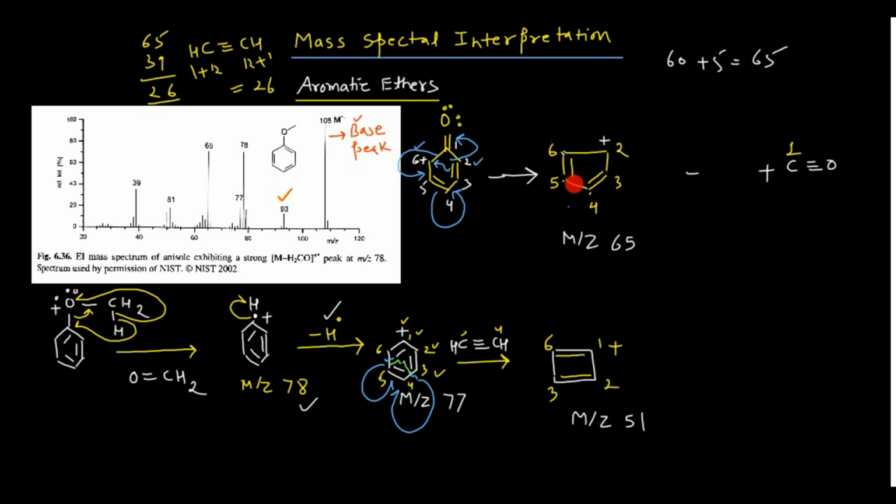It is quite easy now. For this, I will break this particular bond and shift the electron density over here. There is no problem in that. And then you see, I will break this particular bond, and this will make a connection with carbon number 2. So you come down and remove CH triple bond CH from here.